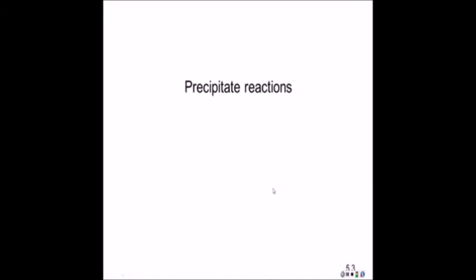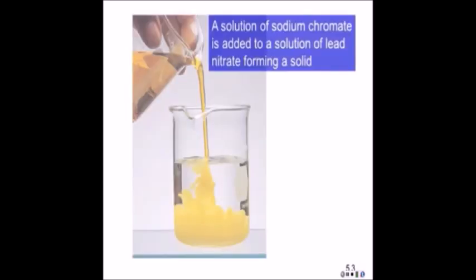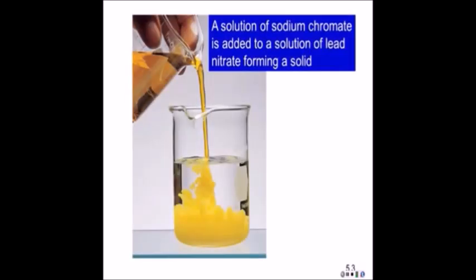Second topic in this presentation, precipitate reactions. So here we go. We have a solution of sodium chromate. That's this one over here. It's a colored solution. You notice it's clear. All solutions are supposed to be clear.